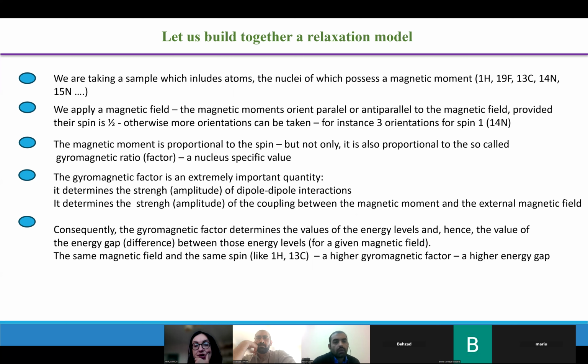And then there is the last thing, and I think we should stop at that moment. When you perform experiments, here we are using the so-called time domain, forget this term, we operate at 20 megahertz, more or less. We are proud that using fast field cycling relaxometry, we can cover a broad range of magnetic fields from, let's say, 10 kilohertz to 20 megahertz.